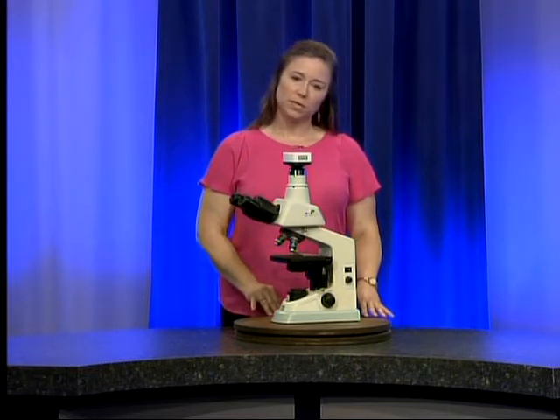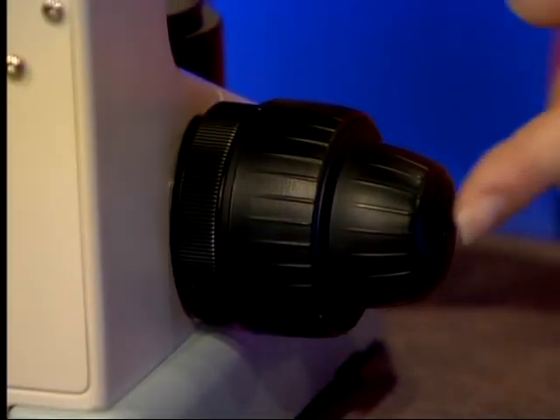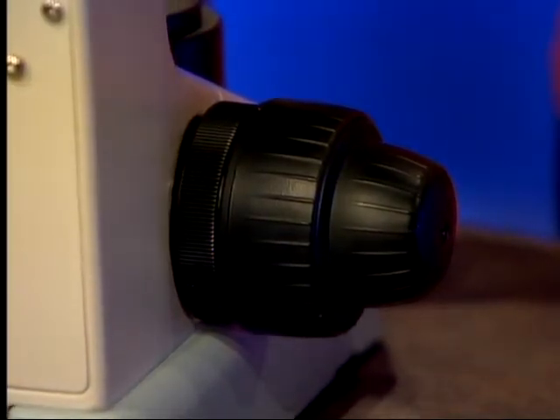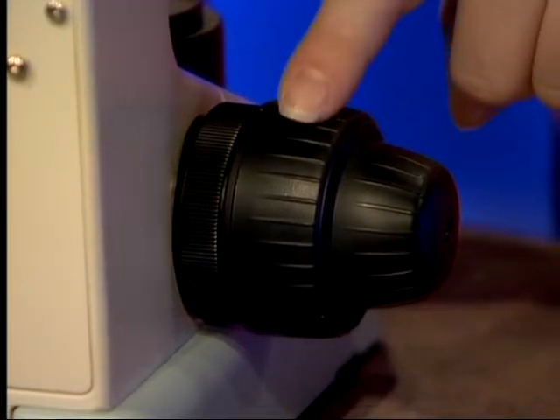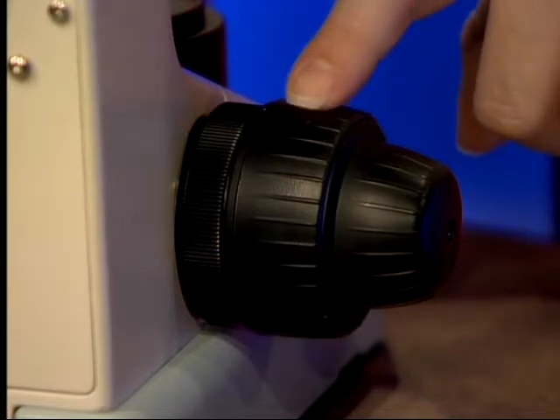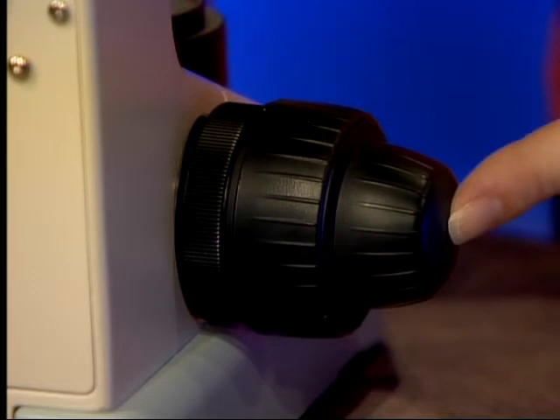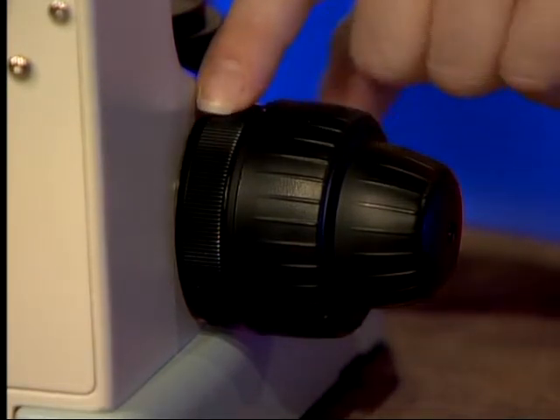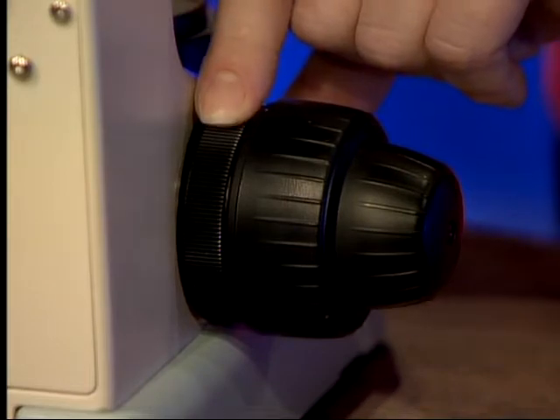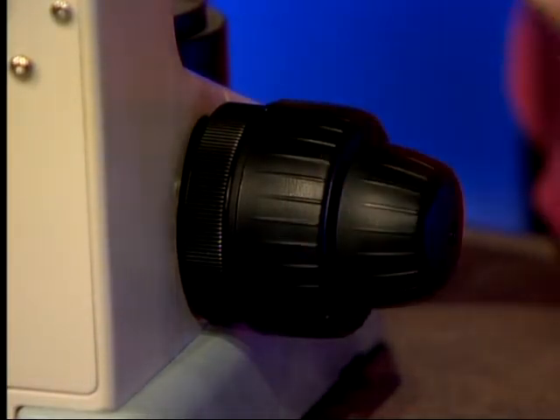First, we are going to talk about the parts of the microscope. On the left side of the microscope you have a knob setup — these are your adjustment or focus knobs. The largest of the three knobs is the coarse adjustment knob. The outermost knob is the fine focus knob, and the innermost knob is a tension knob that adjusts the tension of the whole knob setup.